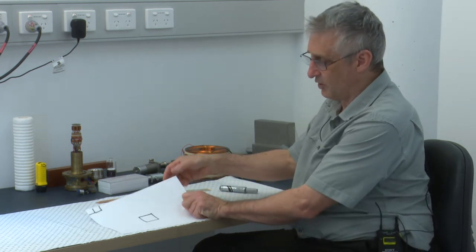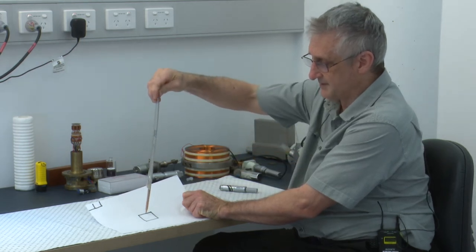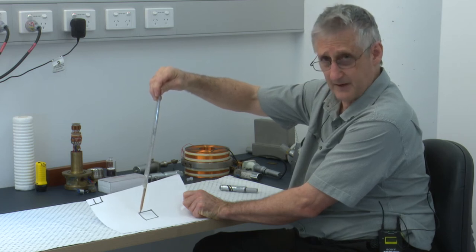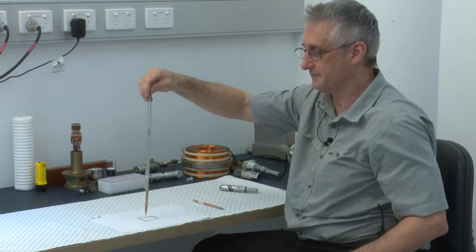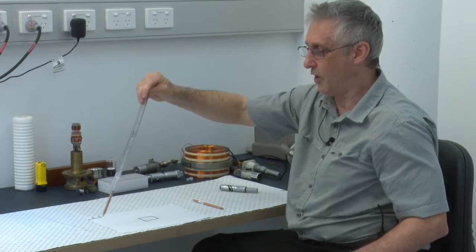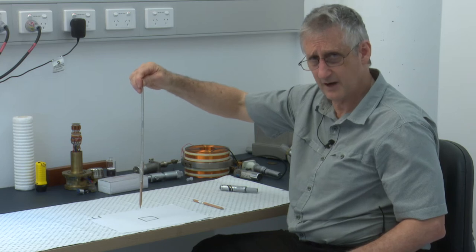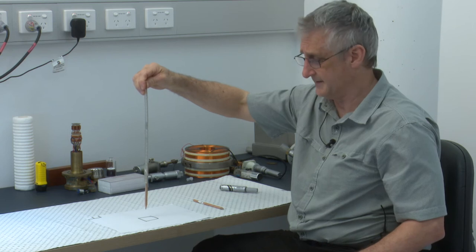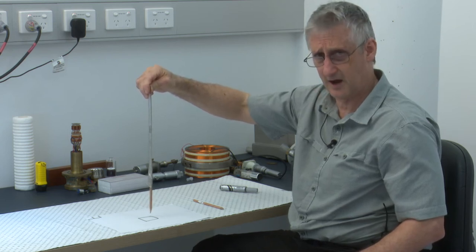And if we're scanning a small area of the scan, the length of the beam in the center and the length of the beam at the edge are pretty much the same, and we don't have that distortion of the edges of the image. The other consideration is that at low magnification, where the beam is doing a wide sweep, can lead to overheating of the scan coils. So when we leave our machines in an idling state at the end of our session, or when we're not using the SEM for any length of time, we leave it at a high magnification to avoid that overheating problem.